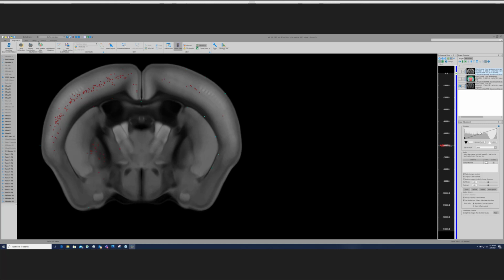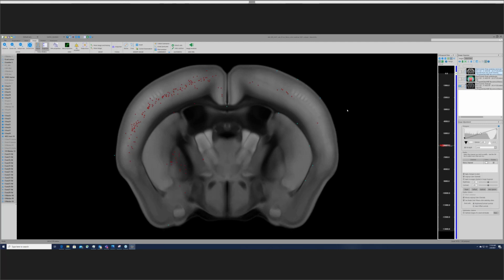As for the Excel spreadsheets, the data presented in the spreadsheet has the cells in each structure. That allows us to do things like, in this case, compare the number of neurons in primary motor cortex or secondary motor cortex between the different experimental conditions: the normal, the Parkinson's model, Parkinson's with L-DOPA treatment, things like that. And I think I am about done.